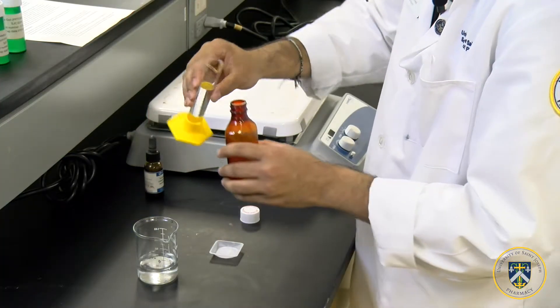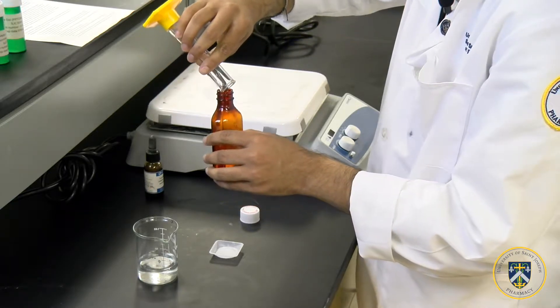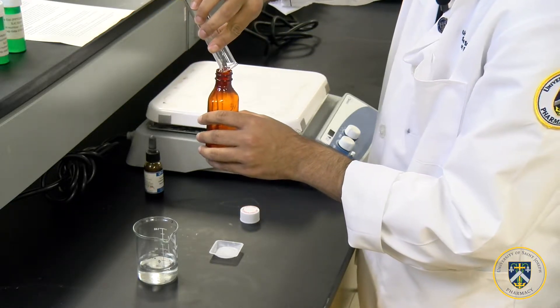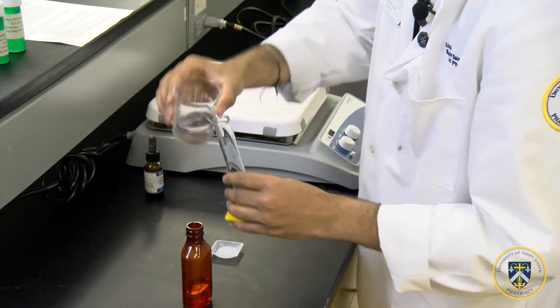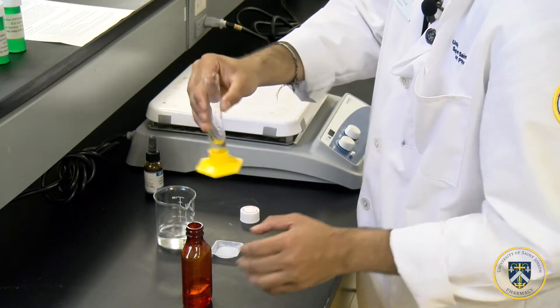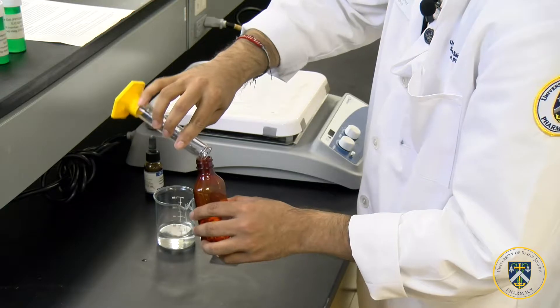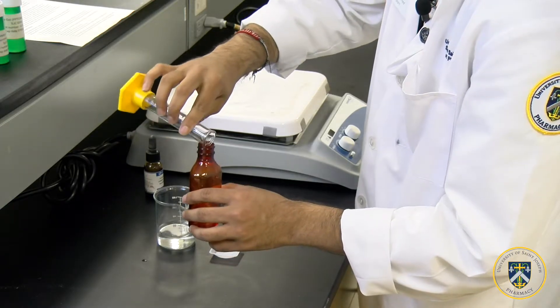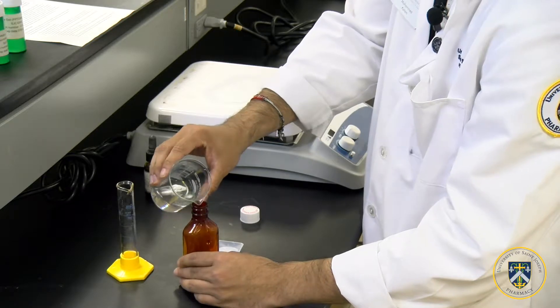After you've dissolved the powder, you can add the required amount of glycerin. Use a little bit of purified water to get the remaining glycerin out of the graduated cylinder, and add it to your formulation. Next, add enough purified water to make your final solution 100 ml.